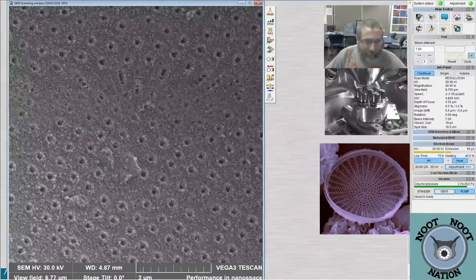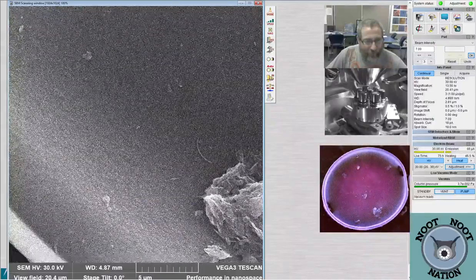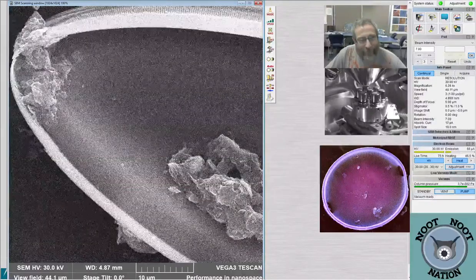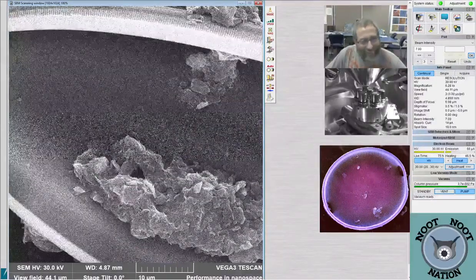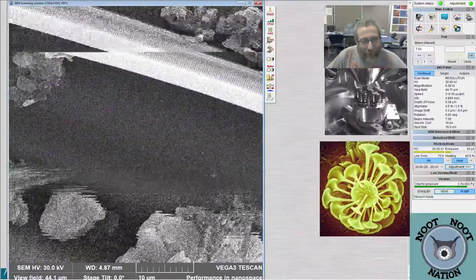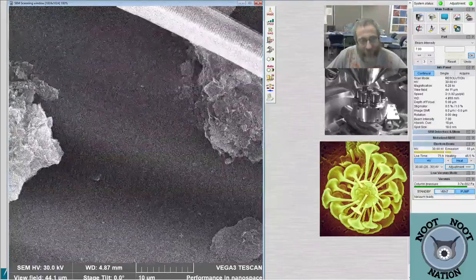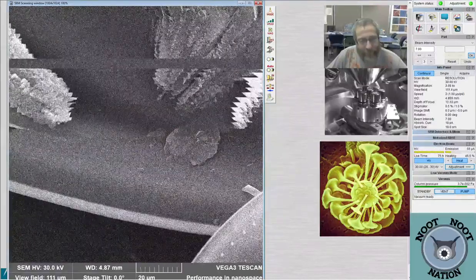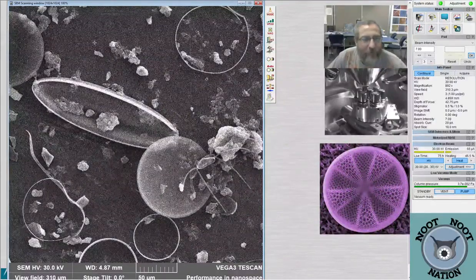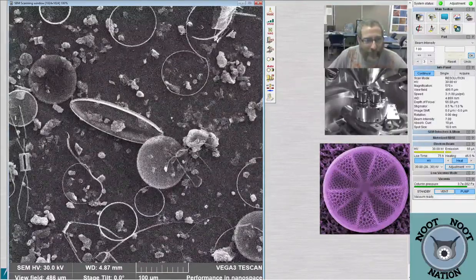But maybe not apparent unless you zoom in a bit. And I think they're in rows. It's not totally clear to me from this view what's going on. And then there's, of course, a pile of junk in the middle of it. But shucks, I don't think that would help us any. I was looking for a raphe, which I don't see. So it must be this thing on the outside edge is a raphe, maybe. But it's face down, so I can't see it.